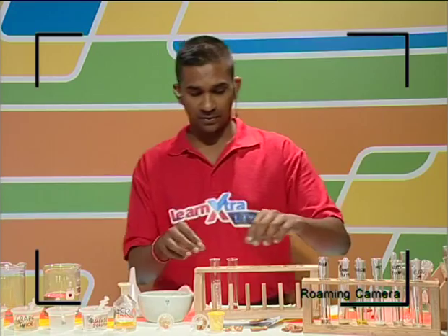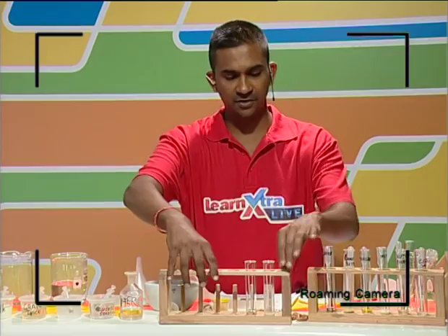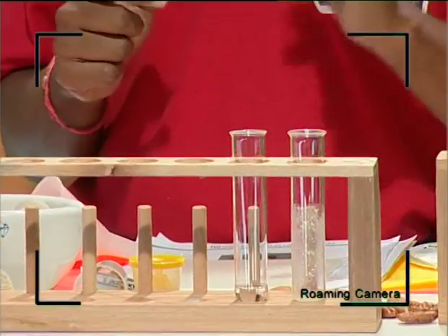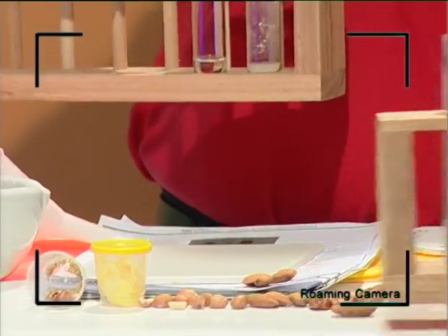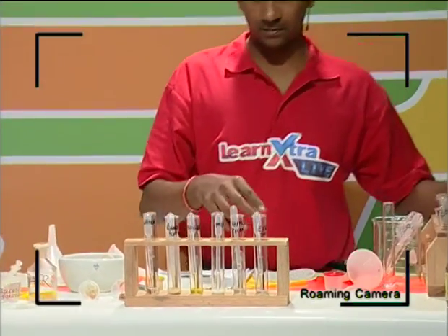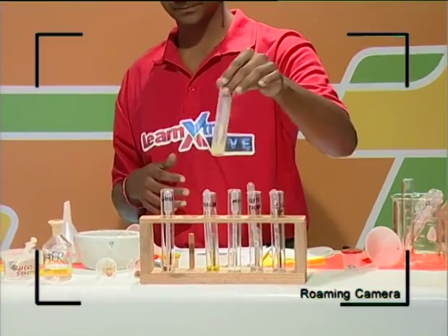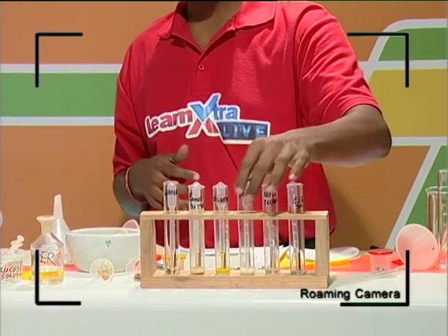I'm just going to turn this around so you guys can see it better. I'm going to move this to the front, and here you can see what's going to happen. This should settle for about half an hour, and unfortunately we don't have half an hour, so I've done this prep work at school and used these test tubes. Here we've got more test tubes that I've allowed to react with the ether. Now I'm going to give them a gentle stir. I'm going to explain exactly what we have in each one of them so that you understand how the results come out. Okay.